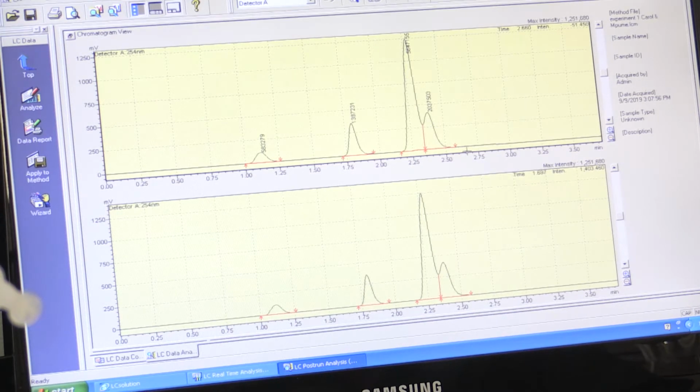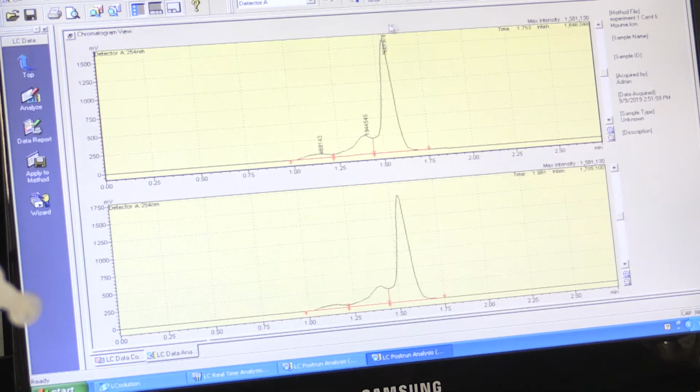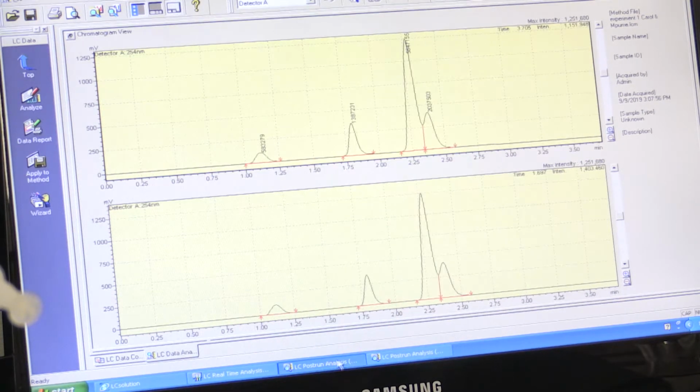For the chromatogram with 100% methanol, you had 3 peaks which were not well separated. Now with the 90% you can see somewhat better separation. However, the last 2 compounds are still very close together, so they are not baseline resolved. Therefore, you will need to again change the mobile phase to achieve better separation.